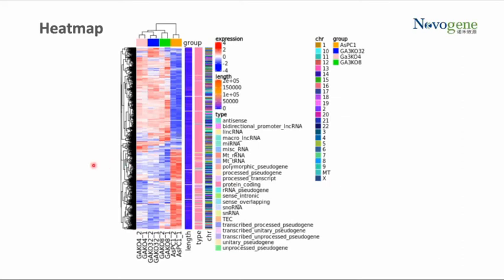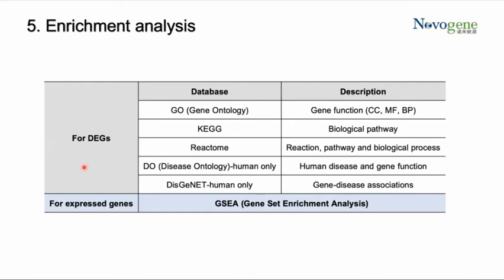So why do we want to present the clustered differentially expressed genes? Because in some analyses or in some species, not all of the genes have been well annotated. Maybe for some of the genes we have no idea how they are involved in this biological process. But by clustering them together with similar expression patterns, it will help us predict their potential function, because they have similar response behavior compared to some genes with well-annotated information. So this heat map will help us study the functional information of unannotated or weakly annotated genes. So that will be the heat map for the differentially expressed genes.